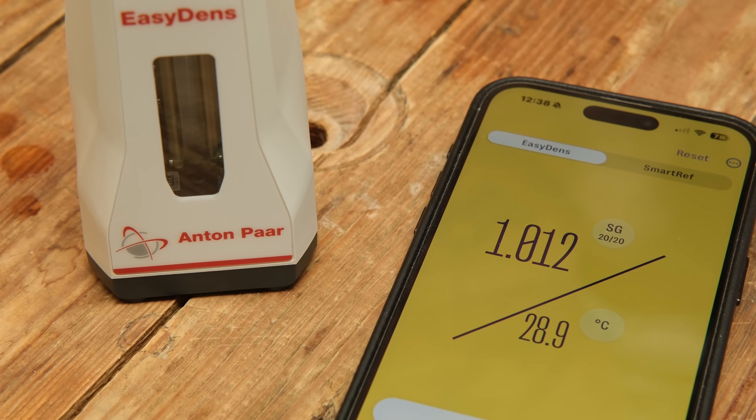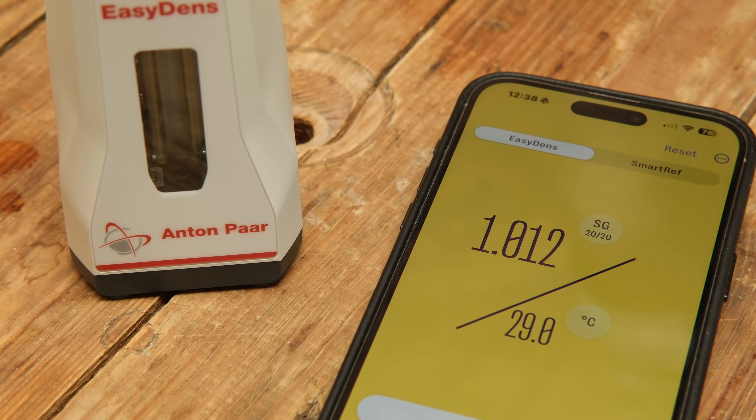Since we started stocking these, we've been talking to some of our partners out in the commercial world — some of the yeast labs we have partnerships with — to find out about their experience using these devices from Anton Parr. And they've been doing tests against their really expensive versions of the equipment and been getting exactly the same results. It's exactly the same equipment inside, the only difference being you're linking it to your device and using the screen on that.